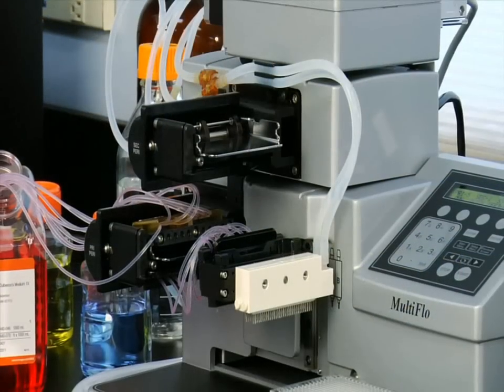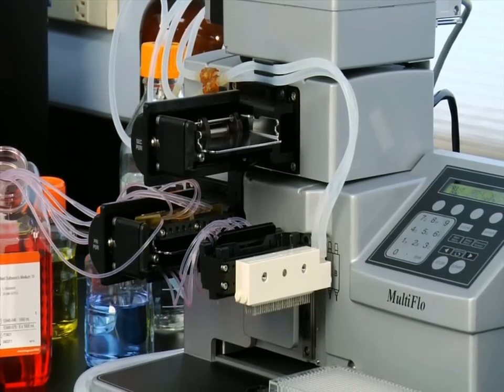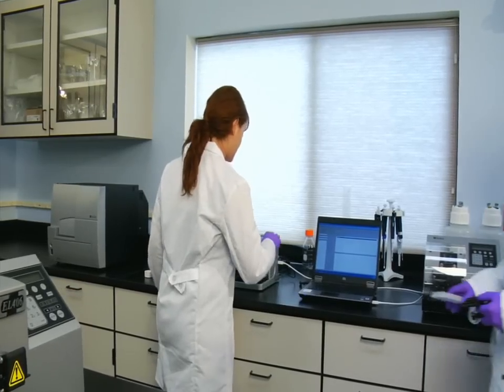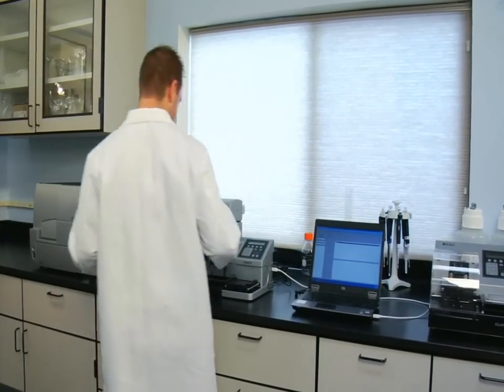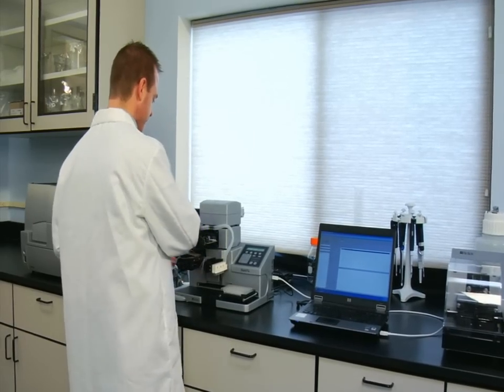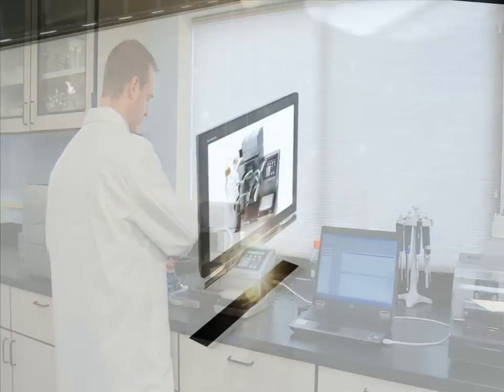The new Multi-Flow microplate dispenser replaces up to four independent dispensers in one compact instrument, reducing costs and increasing efficiency. As you can see, the Multi-Flow saves space, saves time, and simplifies the process.